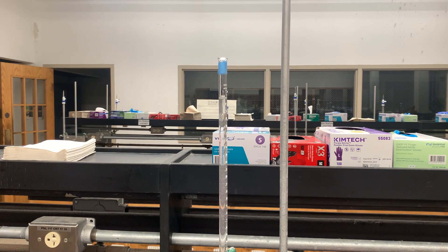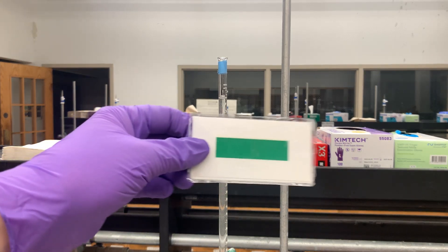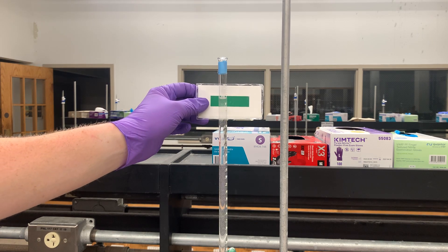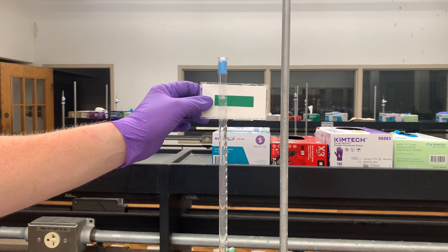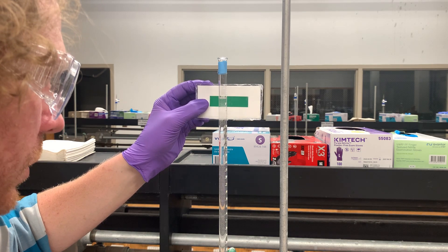In your bin, one thing that you'll notice is you have this little card that has a printed green region, where you can hold that against your burette and see whether or not your meniscus is at 0.0 milliliters.